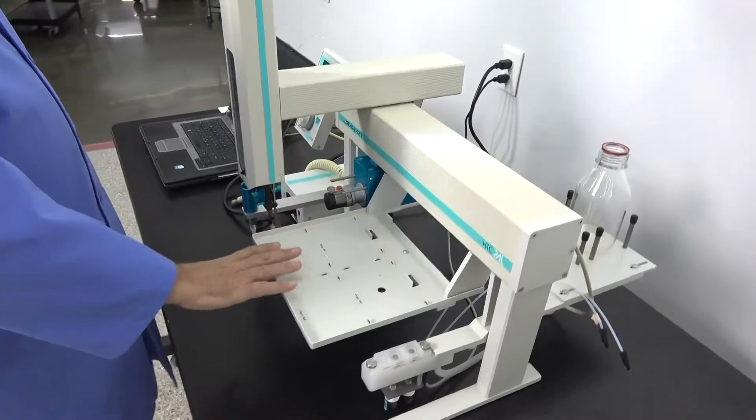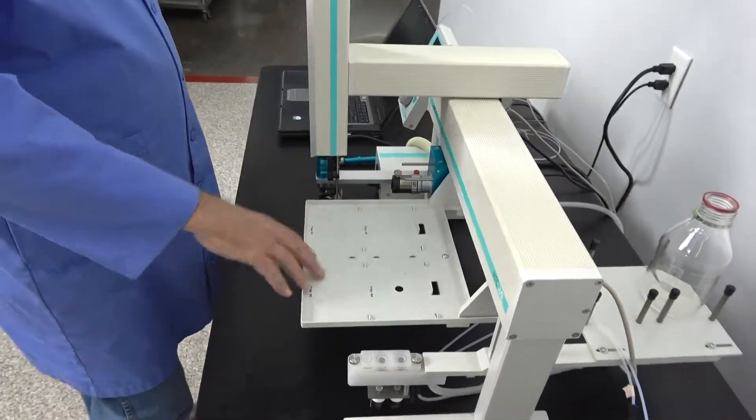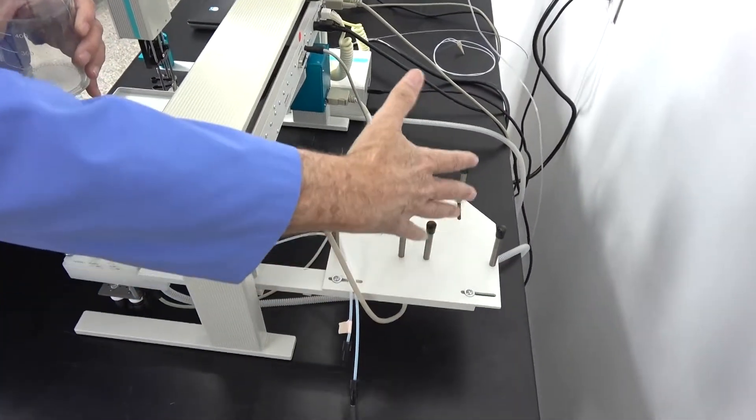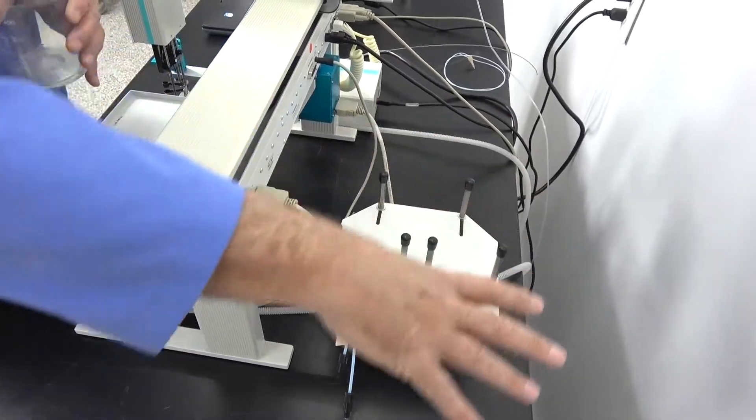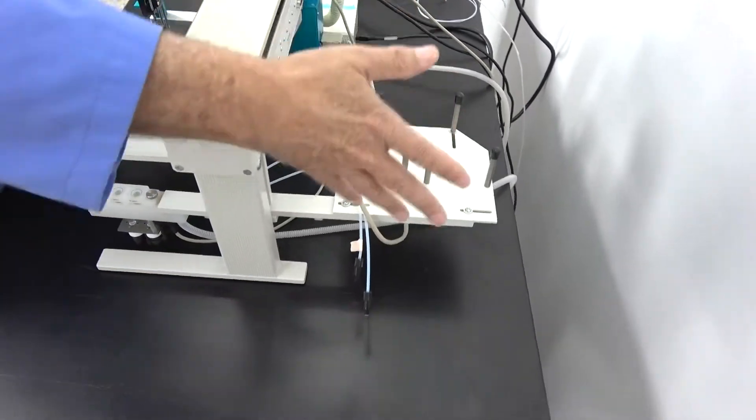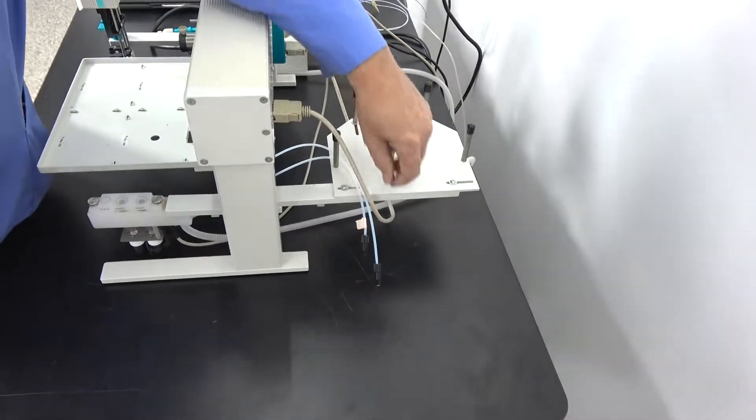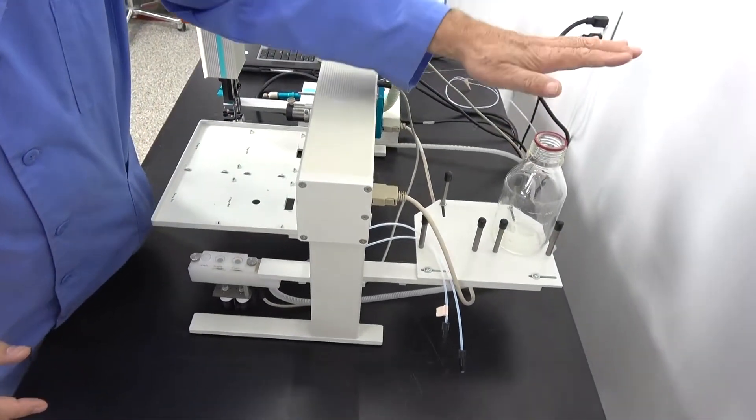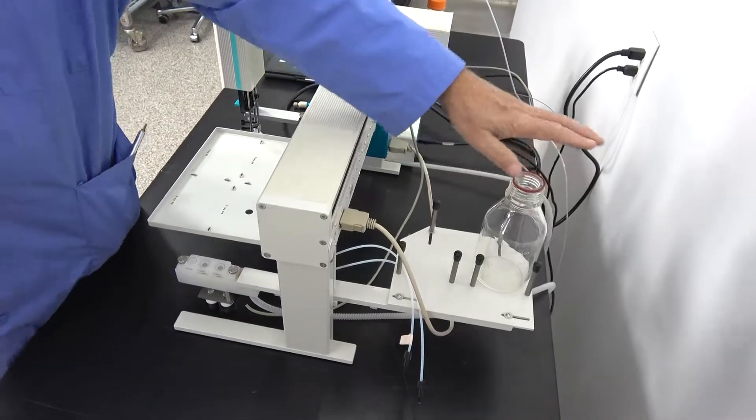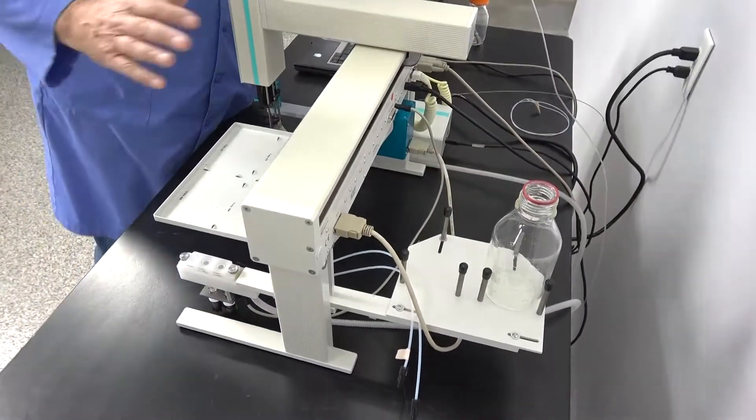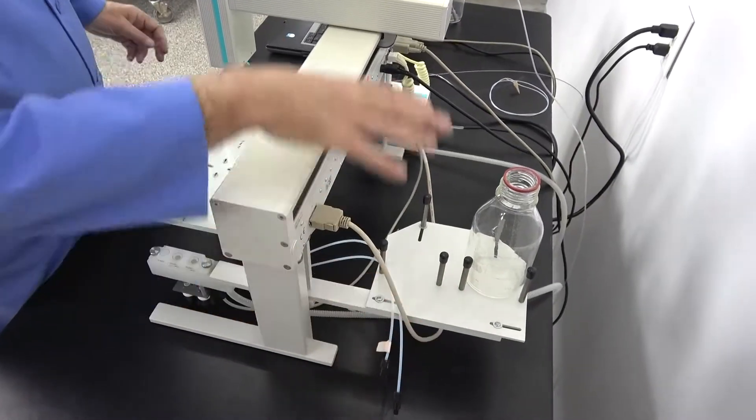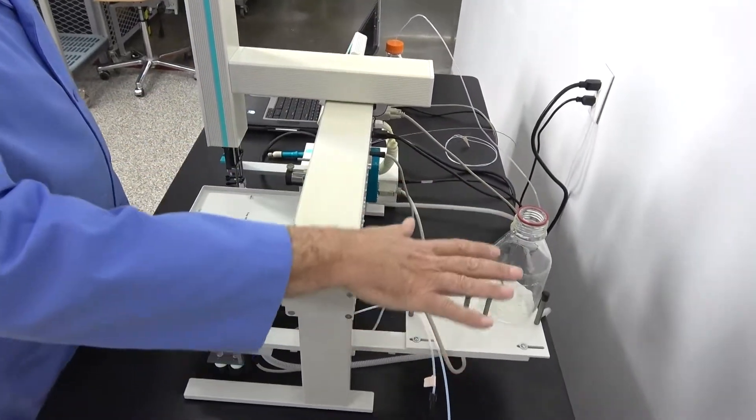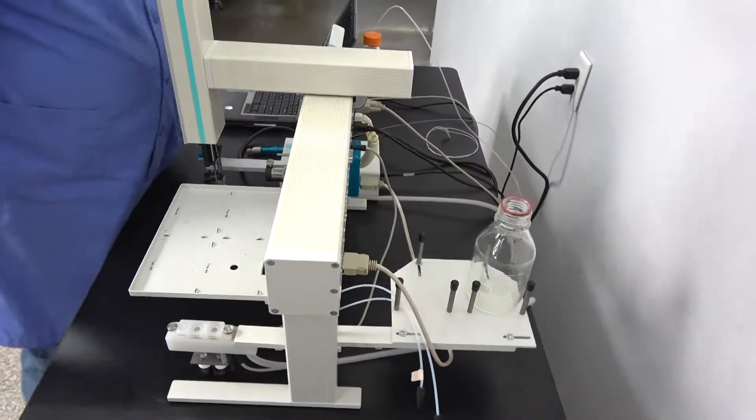Lastly, on these units, this would be the way this unit would ship. This tray for shipping purposes may be detached. Now, when you reassemble it, it can be assembled on this side or, of course, outside the framework. Because this is going to tap in to your wash option here. These are going to be set up to hold bottles. We typically do not sell them with bottles, although that is possible. The reason I would say move this to the outside is these are going to be in the way of your moving arm. So if you're outside the frame, your hosing won't get caught in the arm.